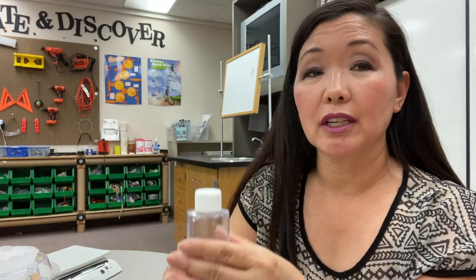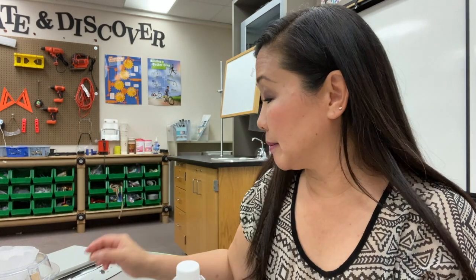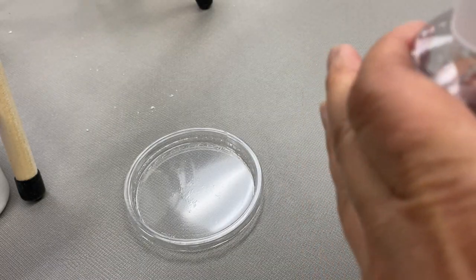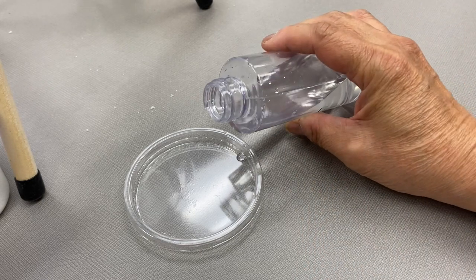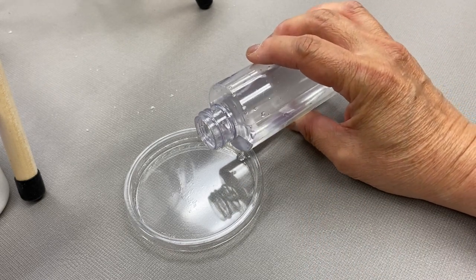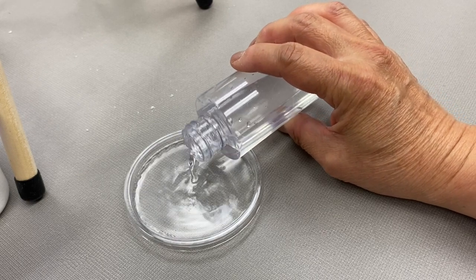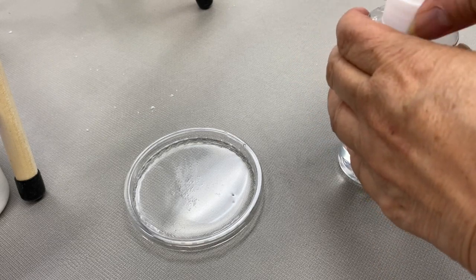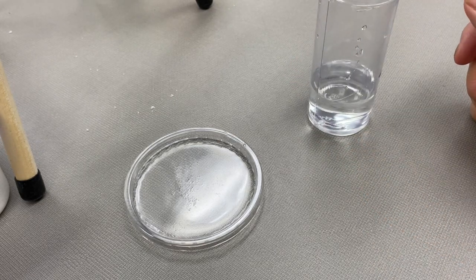Next we're going to pour some of our solution into an evaporation dish and evaporate out the water to prove that there is salt in our solution, and we'll see what we have left. All I'm going to do is take some of our saturated salt solution and pour it in this evaporation dish, and let the water evaporate out. We'll see what we're left with in a few days.